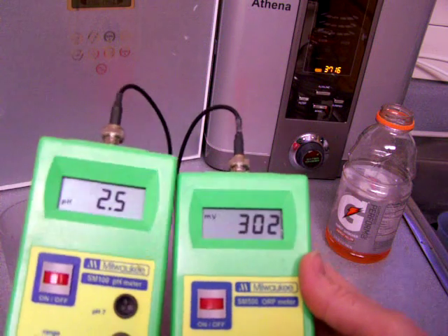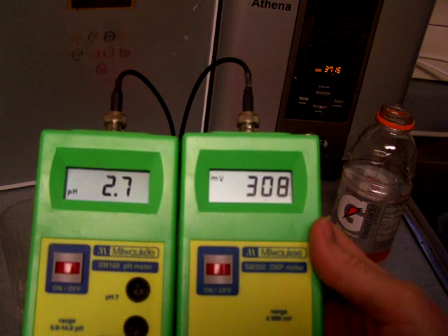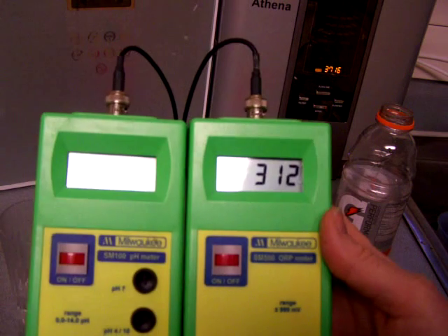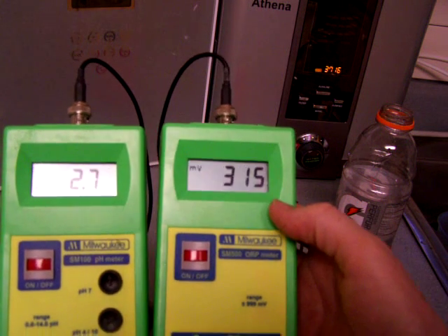Wow, what nice acid. I can't — I'm lucky if I get that acidity out of my acid hose of the ionizer. 2.7. And then it's very oxidizing, 315 positive.